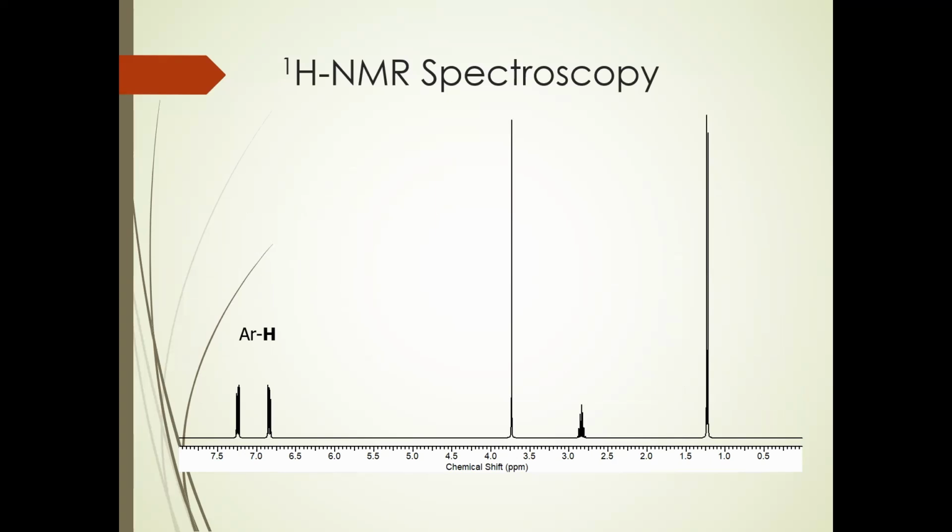We have our next peak around 3.7. Again, that's in that alkoxy range. We would look in that correlation table and we would see this is OCH. That oxygen could be a halogen. There's a reason why in a little bit we'll know it definitely isn't, but halogens, electronegative atoms, bromine, chlorine, oxygen, nitrogen, all put peaks in about this region.